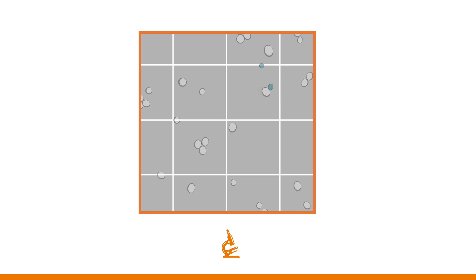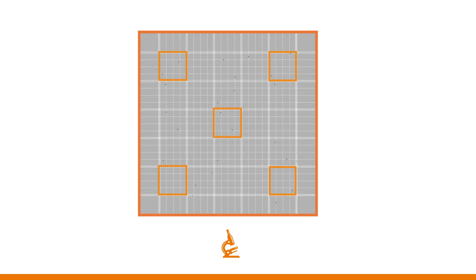Record the total cell count and total number of dead cells. Move on to the next 4 by 4 square until all 5 are completed.